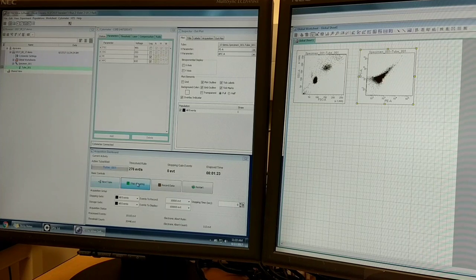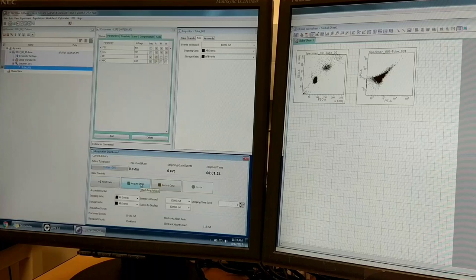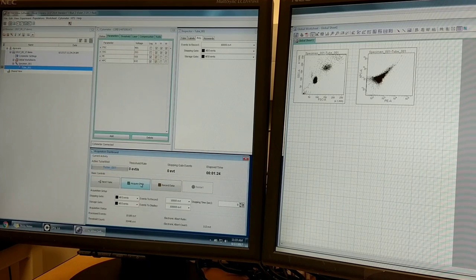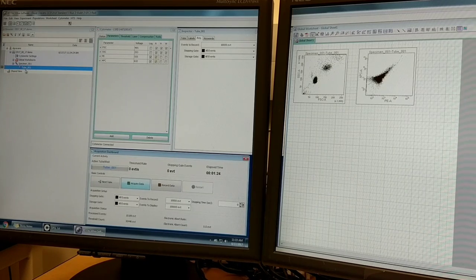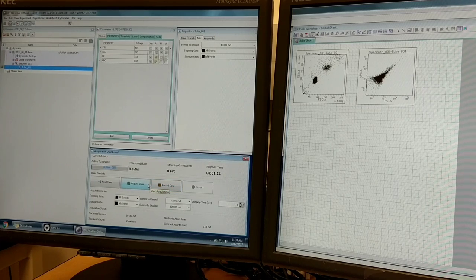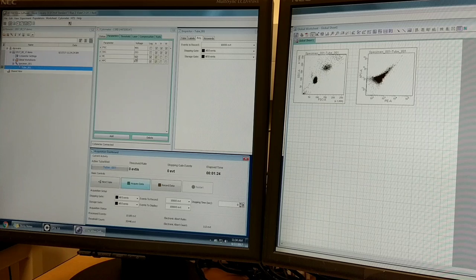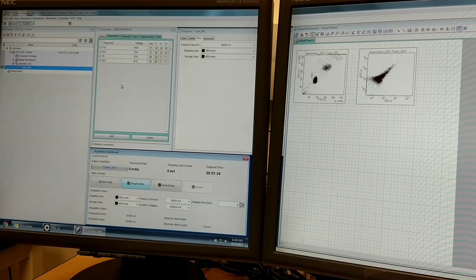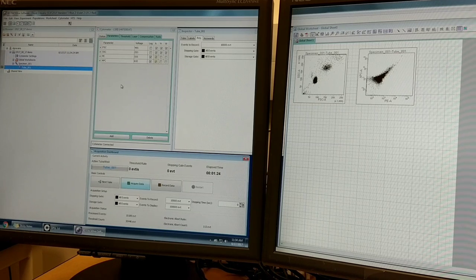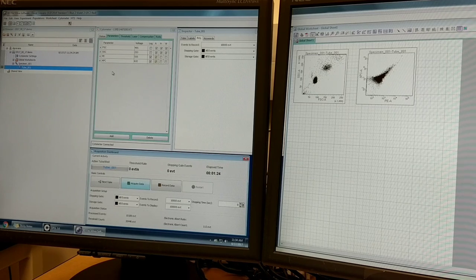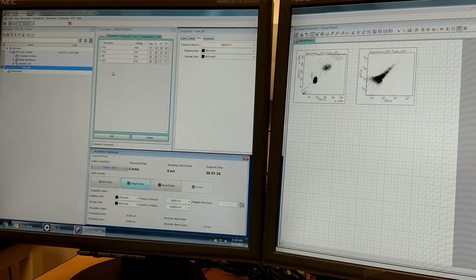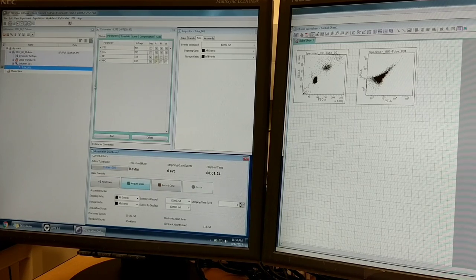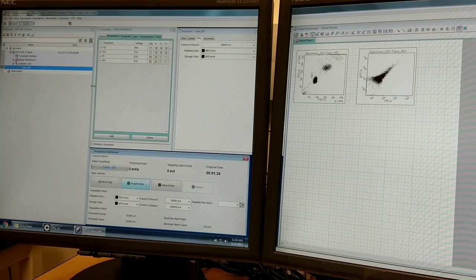The next step is I'll stop acquiring this tube and put my PE labeled tube on. You're going to notice I haven't labeled any tubes yet, this is just called tube one. I definitely don't want to record any data at this point. By recording data, you lock in values like voltage values and compensation values that can become tricky if you switch from tube to tube to keep those things constant. I find the best way to do this is to not record anything until you've fully completed your setup.